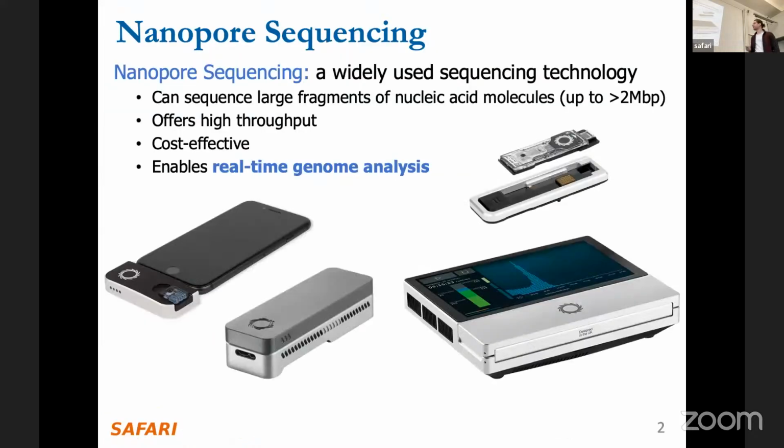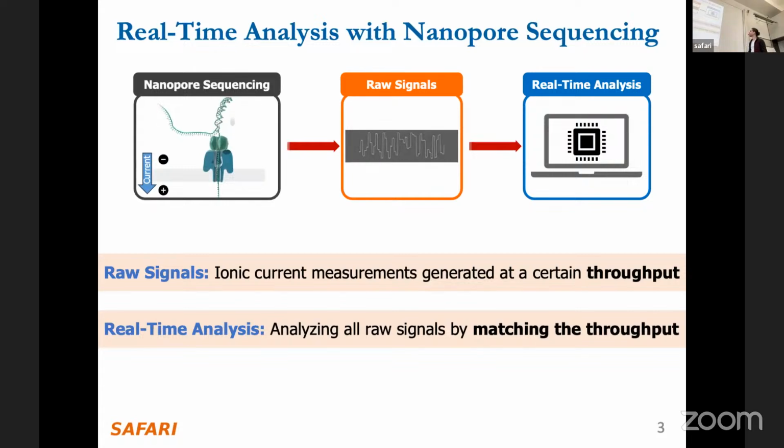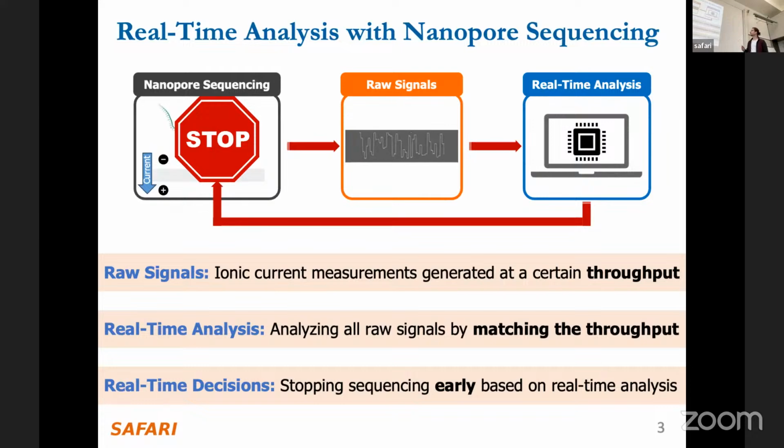So you saw this background, right? We have these nanopore sequencing machines. There are other technologies, but these ones have some unique advantages, and they also have some really unique challenges in their analysis. In particular, if we want to do real-time analysis, we're looking for low latency because this is a feedback loop with real-time decisions to improve our useful throughput, or goodput, as networking people might say.